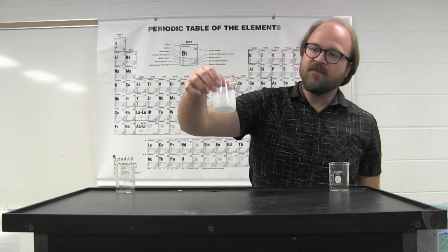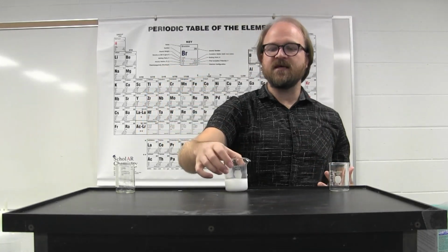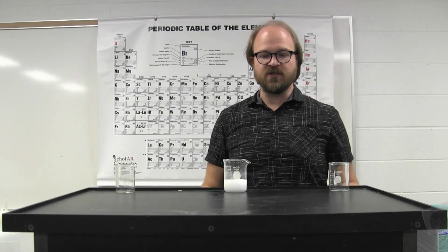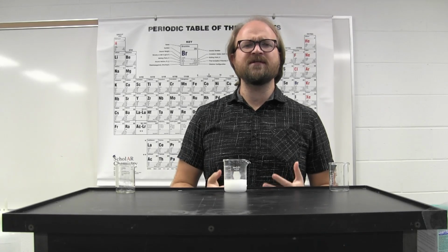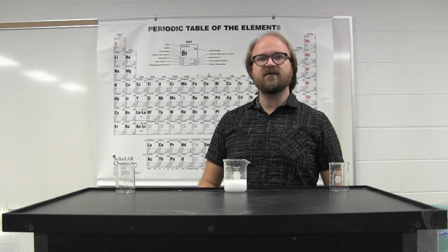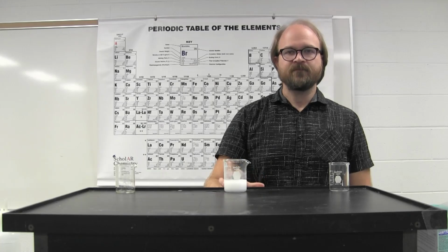And this is not a full chunk of a solid. This is particulate that's dispersed through a solution. Now, anytime you really can't see through the solution, if a solution is cloudy, that is an indication that there is precipitate that is in that liquid.